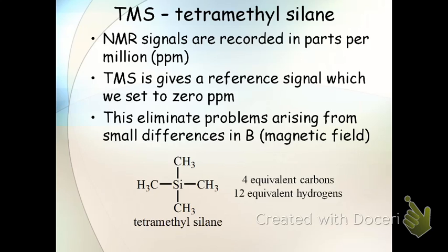If you think about carbon versus silicon, carbon's more electronegative. So the carbon tends to pull electron density from the silicon, and as a result, those hydrogens on those methyl groups are highly shielded from the magnetic field. That means they're almost always to the far right of our spectrum. There are a few other compounds which are much harder to make, and also more expensive to use. You can shift even further to the right, but TMS is relatively easy to get in high purity, gives a strong NMR signal, and is generally the furthest peak to the right on the spectrum.